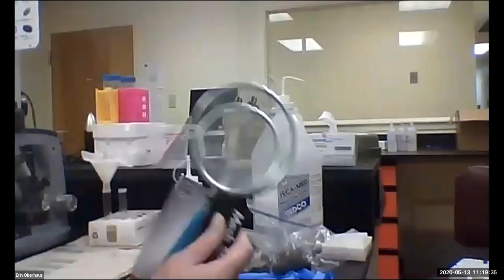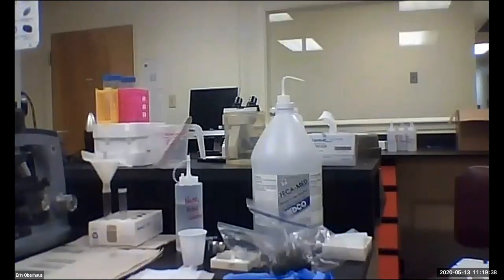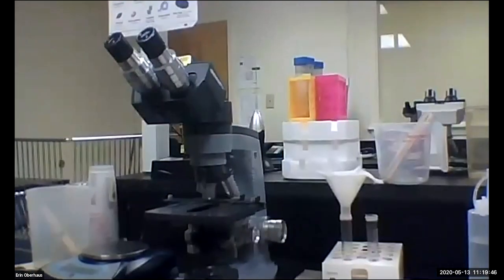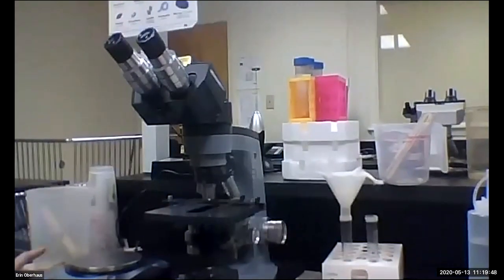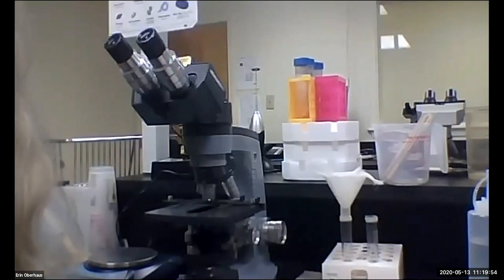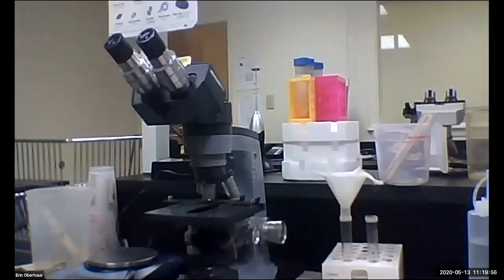So you can purchase a tea strainer if that's a better option for you. And you'll need a microscope. You get a little closer here. A microscope and then something to weigh your sample out in. You're going to be calculating eggs per gram. So it's important to know how many grams of feces you're actually using for your fecal egg count.